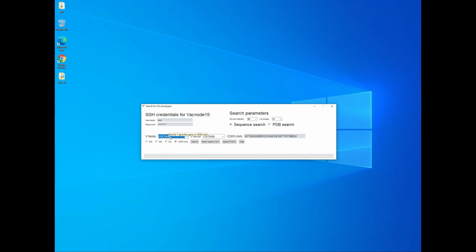Just be certain that you are looking at an amino acid sequence with any additional residues truncated off. So for example, if you've got a leading cysteine, you will want to cut that out. That's junctional information rather than strictly the CDR3 that we're going to be looking at. And so if I search on CDR3 only in SEEQ, I don't anticipate that I'll have any matches, but we'll see what happens.